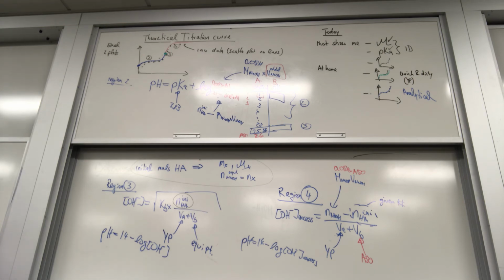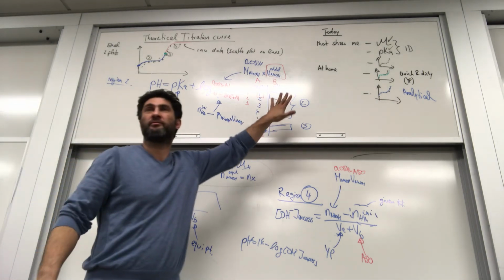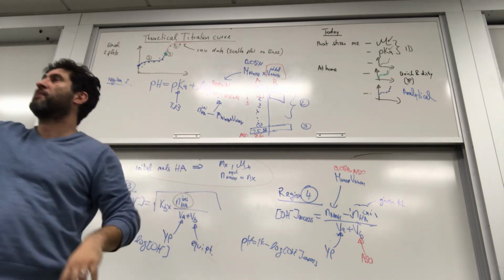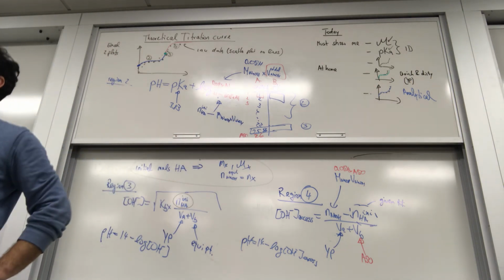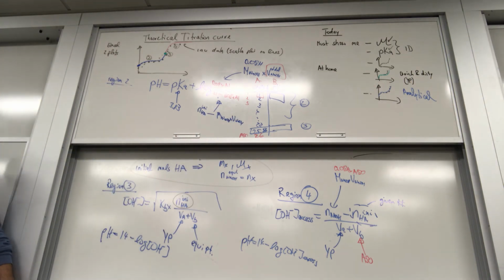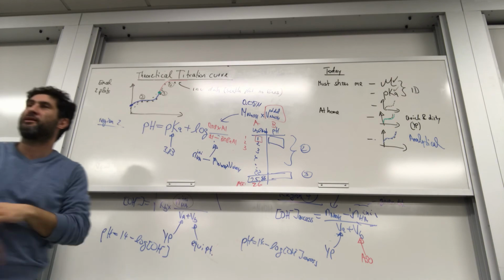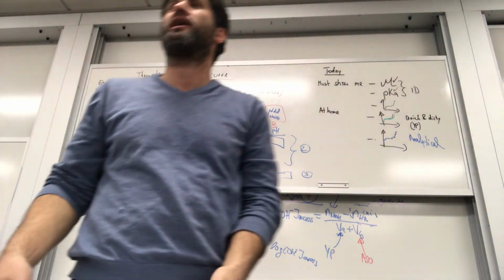Once you do this, all you need to do is sketch the two plots in Excel: the scatter data and this table. So two graphs in one, and this one can be just a line plot. And that will create this line and then the dots representing the data, and you can see how close the line is to your data.